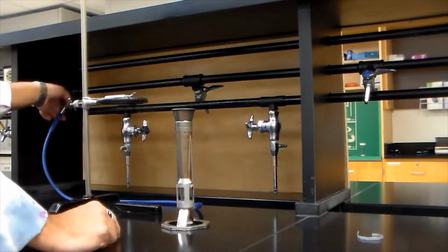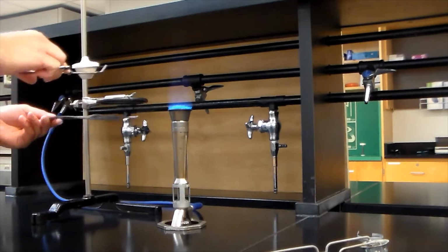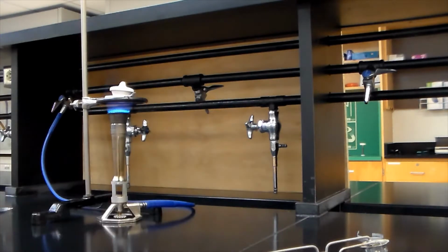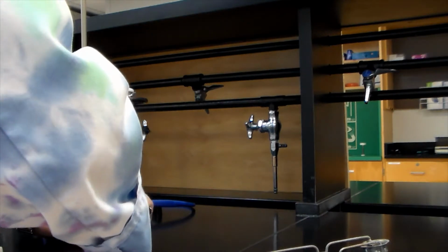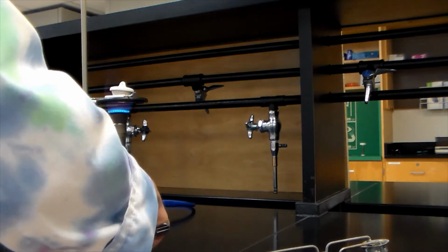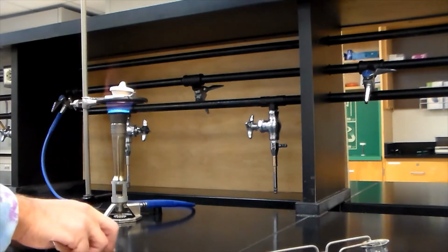Clamp an iron ring to a ring stand and place a wire triangle, clay triangle, on the iron ring. Adjust the height of the iron ring to accommodate a Bunsen burner. Place the covered crucible on the wire triangle and heat for 3 minutes with an intense flame. The bottom of the crucible should be in the hottest part of the flame. Note the bottom of a properly positioned crucible should eventually become red hot.